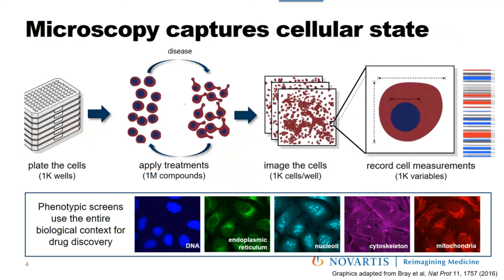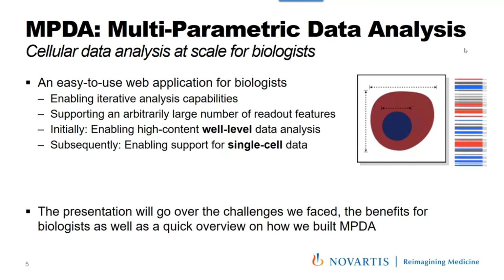And so this is where multi-parametric data analysis comes in. That is actually the name of the platform that we have developed.